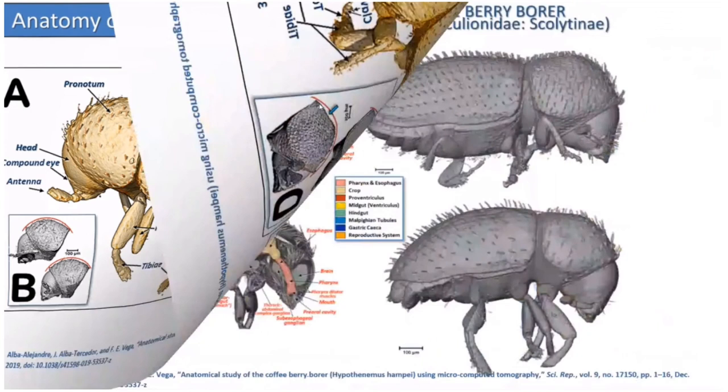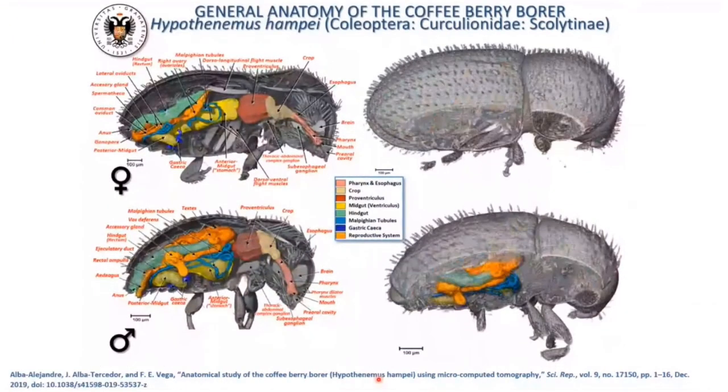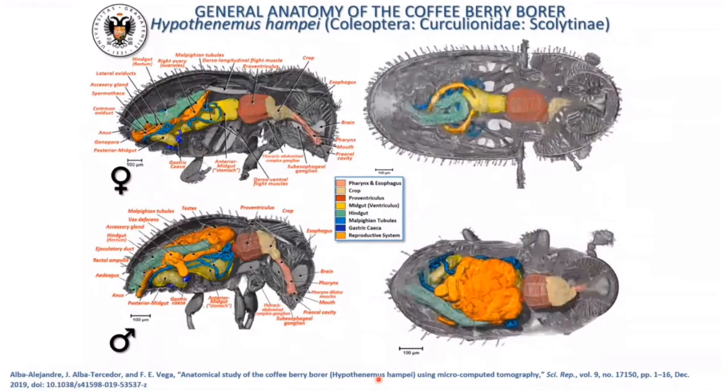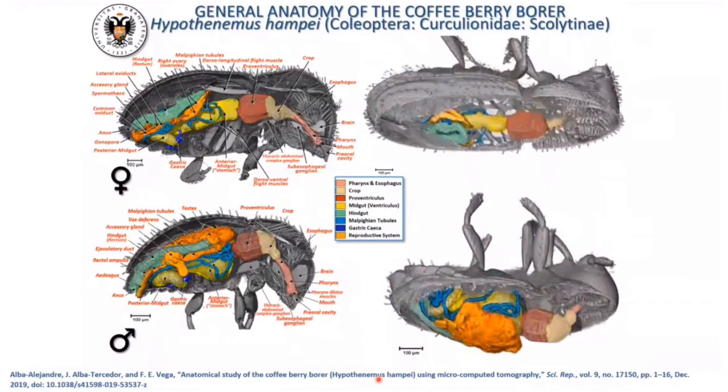We could study the internal anatomy in a way that has never been seen before. It's something that we saw in drawings, in entomological books, but nothing similar extracted directly from reality, because this is not animation, this is real.